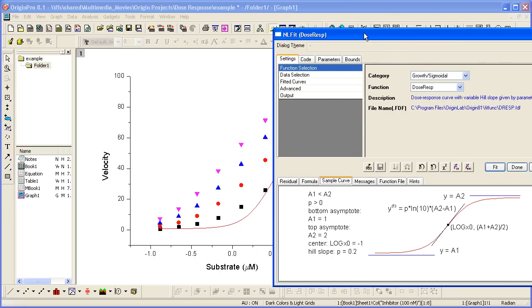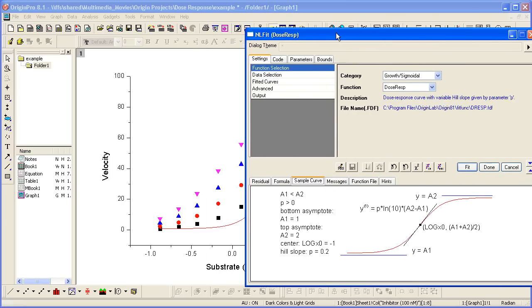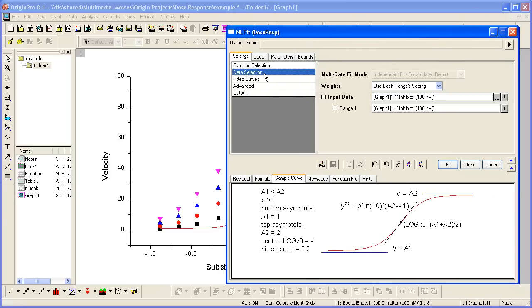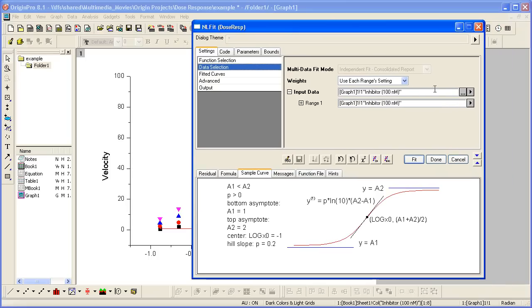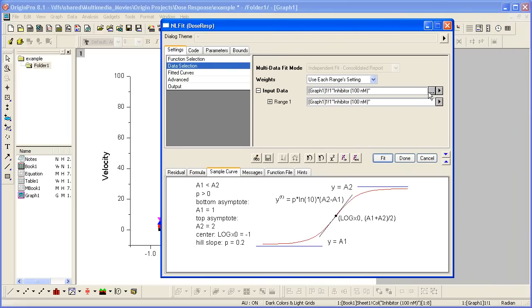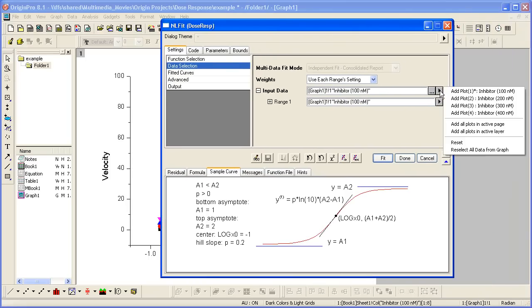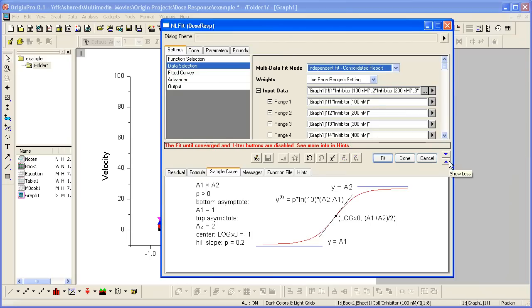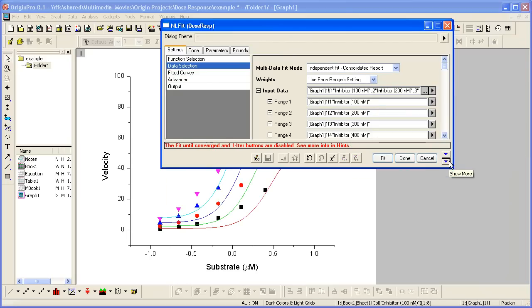Now, we have four curves here, so we need to go to data selection and change our input. Let's position this. Change the input to add all plots in active layer. We can collapse the dialog. And now notice the fit curve for each. We have the four input ranges.